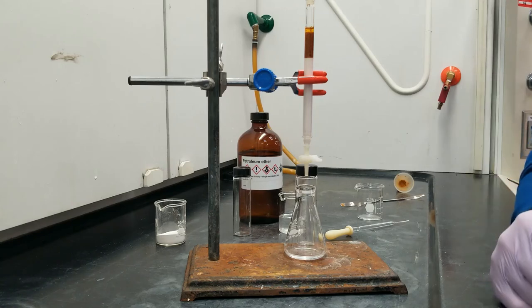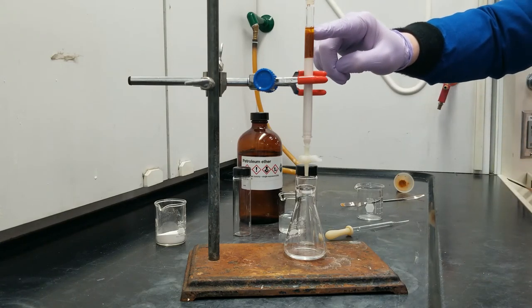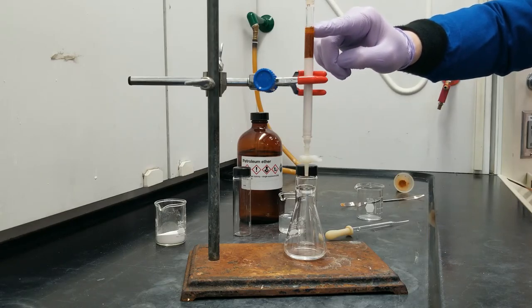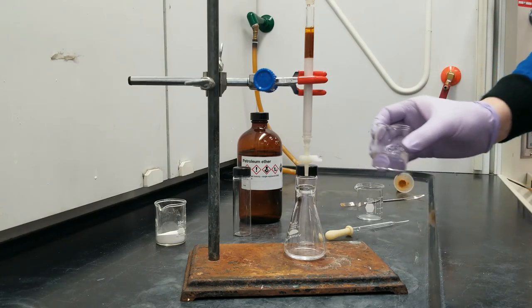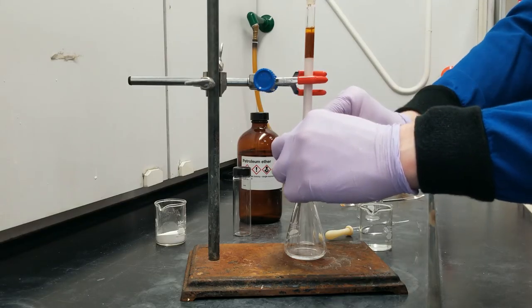Sample. It's ready to run down. I'm about to run dry because my solid level has just risen and I am just a couple of millimeters above it with my solvent. So I'm going to hit that with a little bit of petroleum ether right when I open this up.